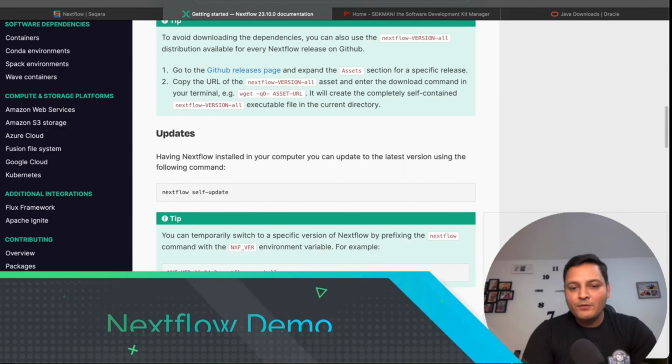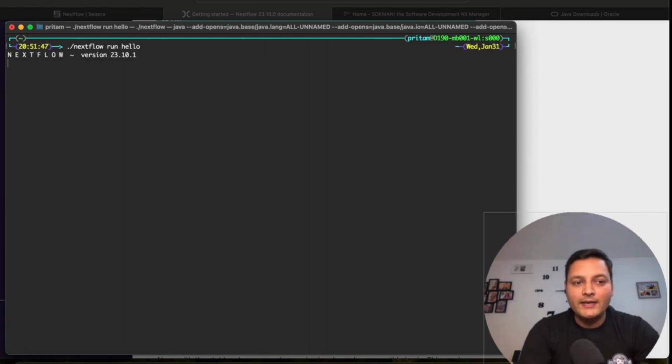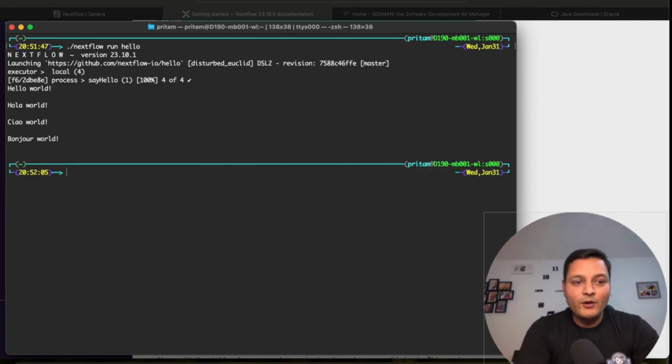To run a demo, you have to type in nextflow just to check whether you have installed it properly or not. You type in nextflow run hello, and you can see the output like hello, hola, bonjour, something like that. You can say hello world, hola world, ciao world, and bonjour world. And yeah, this is how you install Nextflow, and you can see that the DSL2 version has been installed. This is the latest one. Previously it was DSL1, now it's DSL2.